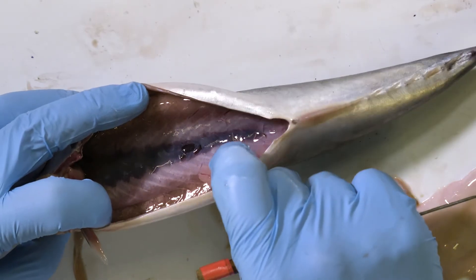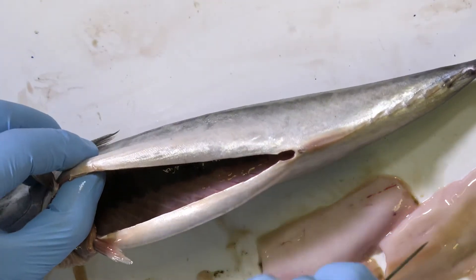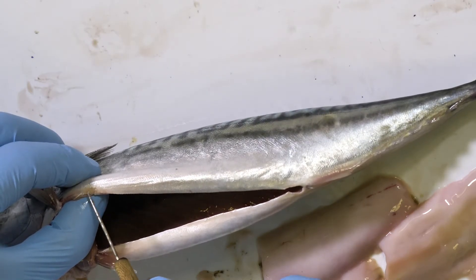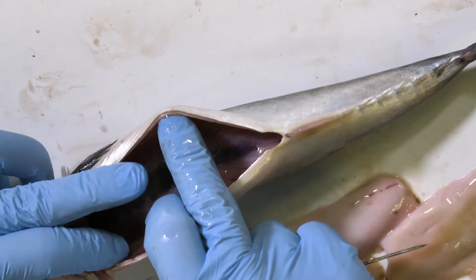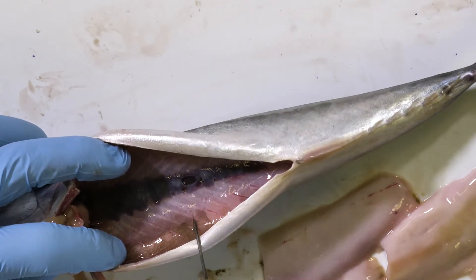Typically when we dissect a number of fish we find that about half of them, or maybe more than half of them, are infected with Anisakis. But that obviously depends on a number of factors, perhaps including the time of year, the region that the fish were caught, and how the fish have been stored subsequent to being caught.